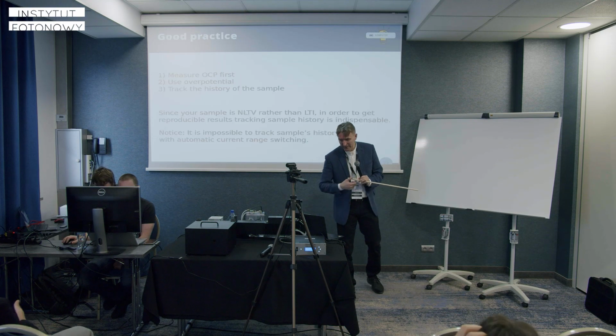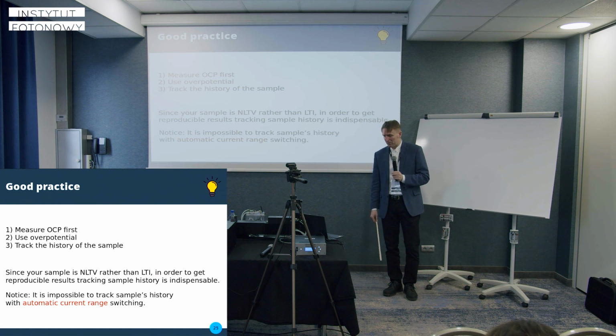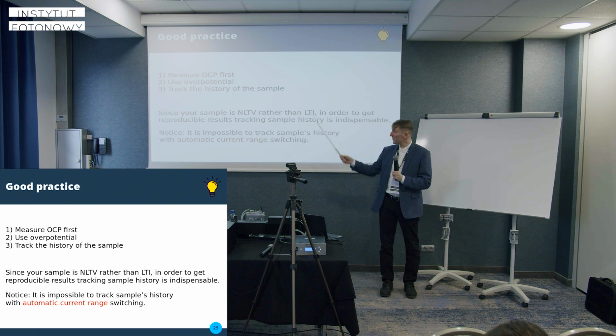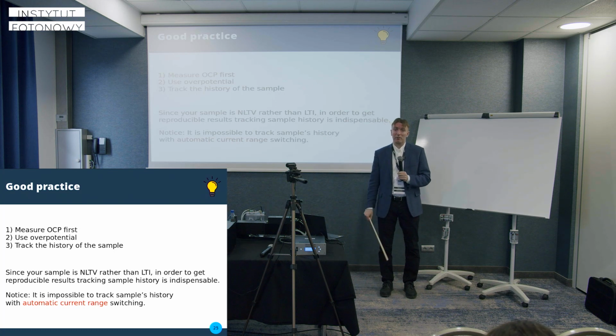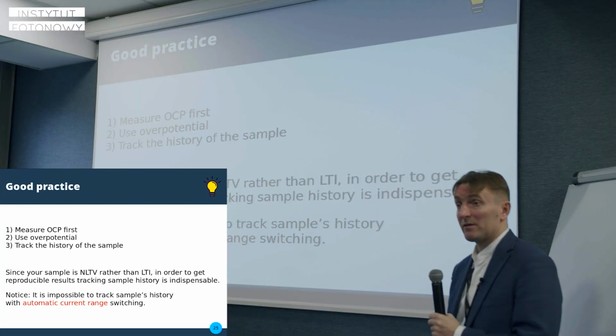So let's summarize it as a good practice in measuring nonlinear samples and non-LTI samples. First, measure the OCP, then use overpotential and track the history of what measurements you have performed on those samples, because they will remember the history.